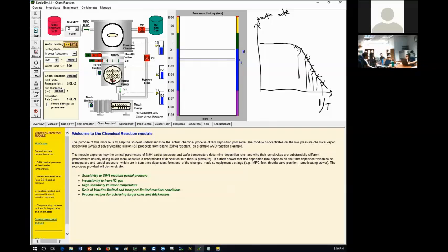Okay, so this is a good deposition. It's a very good deposition value. It is 1.6 times 10 to the minus 1, so that means 1.6 angstrom per second. It's a very good deposition rate. Even though it may sound ridiculously small, I'm accustomed to these kinds of values. All right, 1.6 angstrom. Now, we have seen this linear change, hopefully. I've shown you this linear change. You have sensed the linear change.